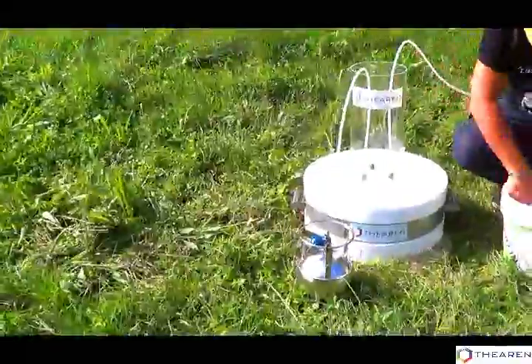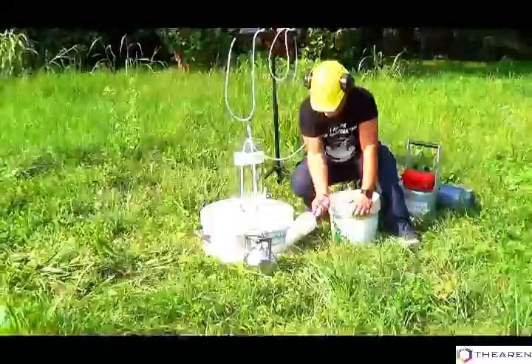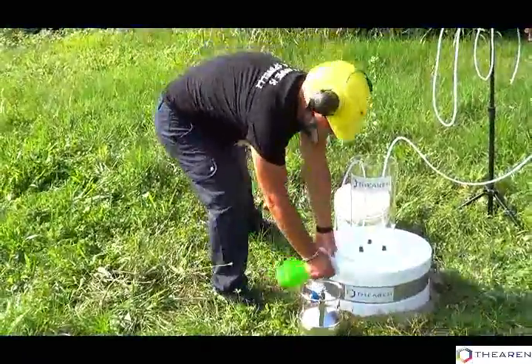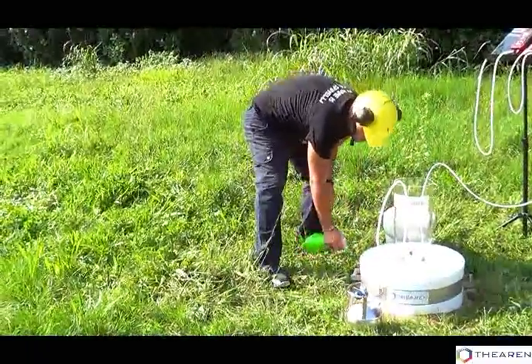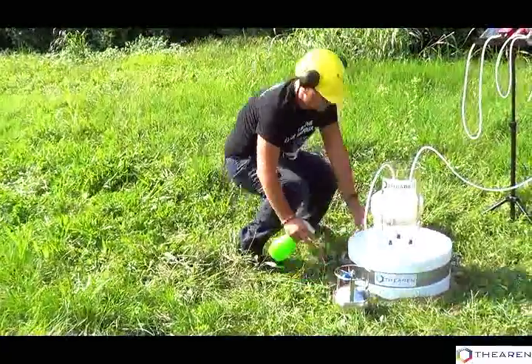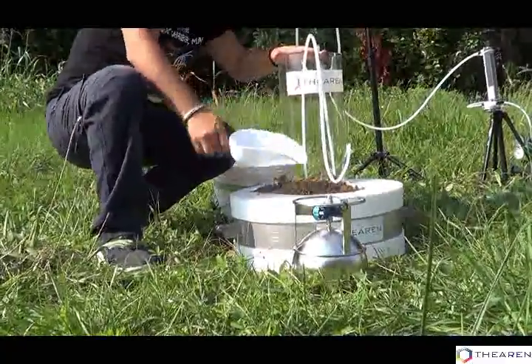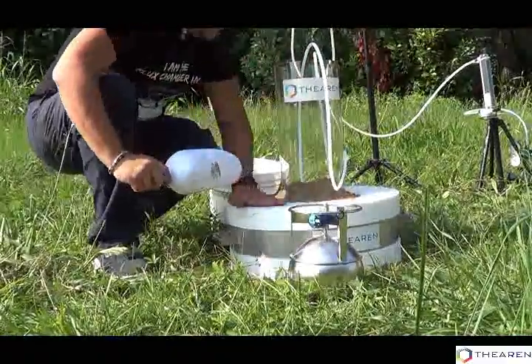Fine sand is placed around the chamber to seal the equipment to the ground and to prevent external air from entering the chamber itself. The sand must be periodically humidified, especially in hot season, to maintain its sealing effect. Sand must also be placed around the windbreak to protect the sampling holes and the vent hole.